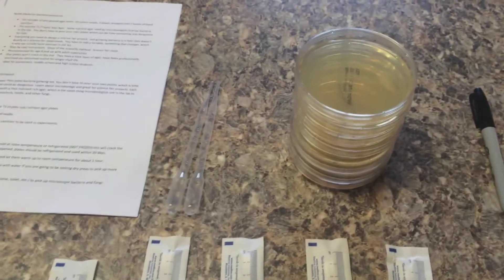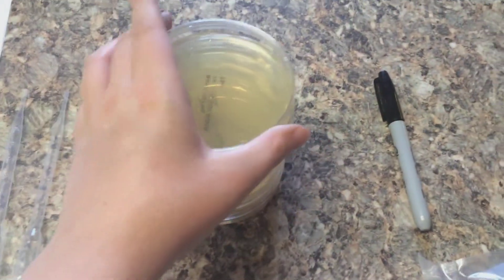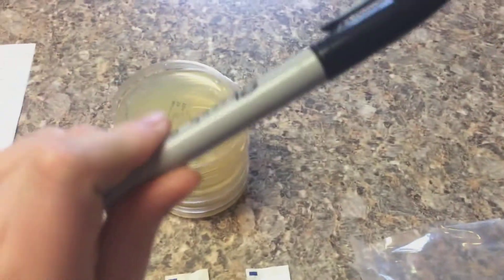Everything you need for this experiment will be found in your kit. We'll give you swabs, pipettes, plates, and instructions that tell you how to go about the experiment. The only thing you should need to bring in yourself is an ordinary Sharpie, and that's just to make sure that you can label the plates.